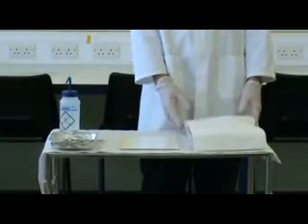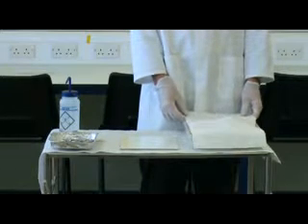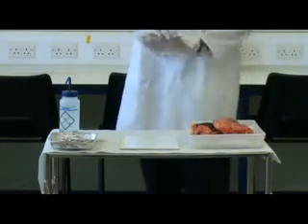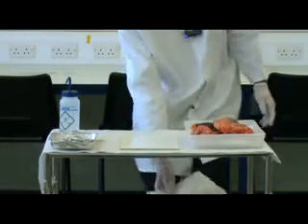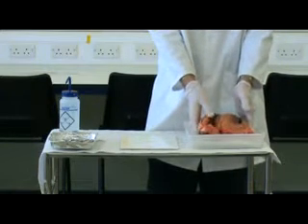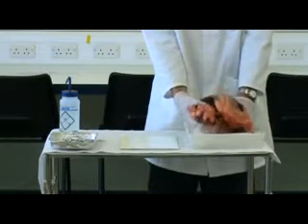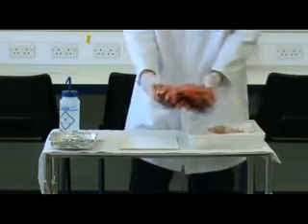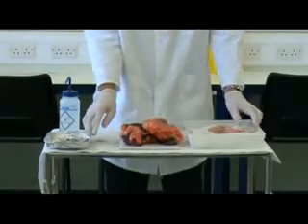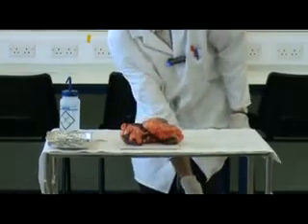What we're going to do now is go through the heart together, and this is an ox heart. Once you've got your gloves on, you're very welcome to lift it and place it gently on the tray, and we're going to now examine the outer surface of the heart.